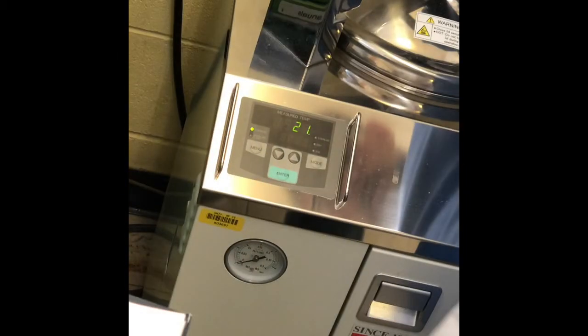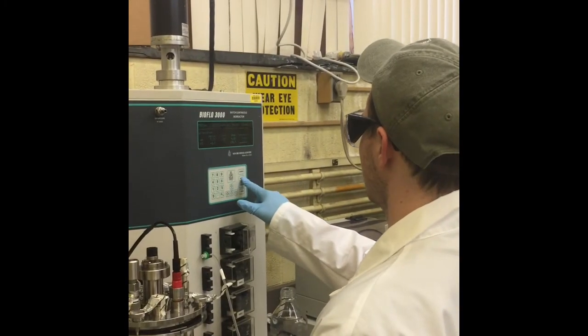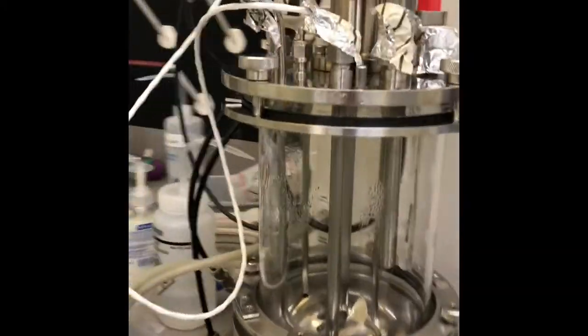We then ensured the autoclave was set to sterilize and not sterilize and dry due to the liquid media. pH probe and dissolved oxygen probe calibration then took place. By the end of day 2, the bioreactor was assembled, the pH and DO probes were calibrated, preparation of inoculation flasks was complete, and all material required for measuring bacterial growth was in place.